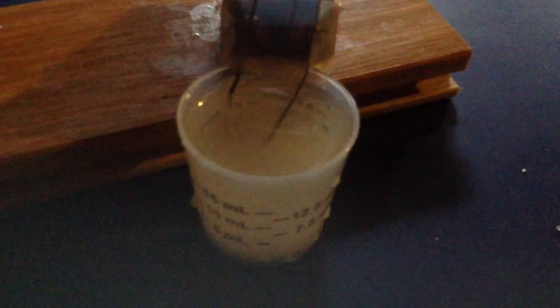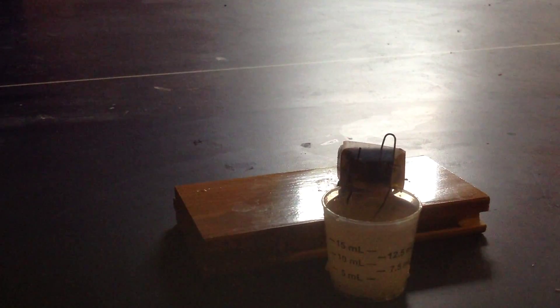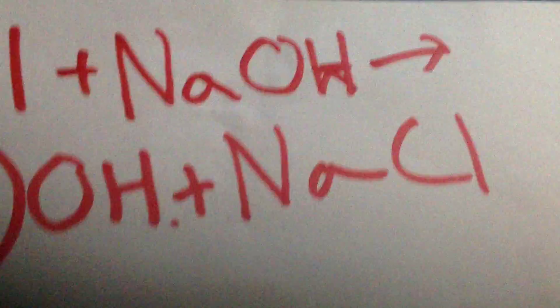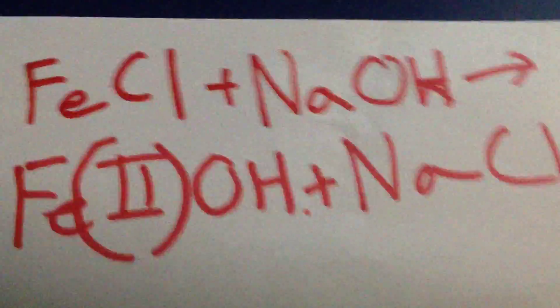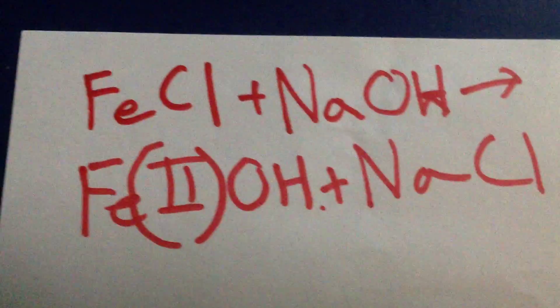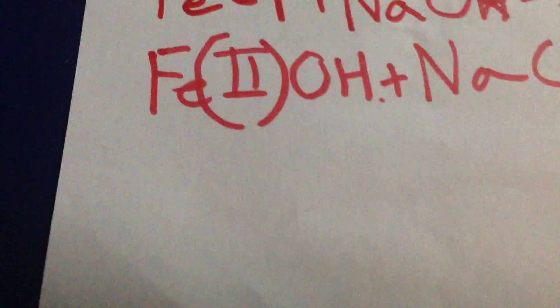You see at one electrode, the negative one, there's bubbles and the other one there's not. There should be oxygen bubbles but there's not because the iron is reacting with the chloride ions to form iron chloride and on the other side the sodium will react with the hydroxide ions that didn't turn to oxygen to form sodium hydroxide. This is the classical way of making iron 2 hydroxide which is the precursor to magnetite. So then they react to form iron 2 hydroxide and sodium chloride that was originally there.